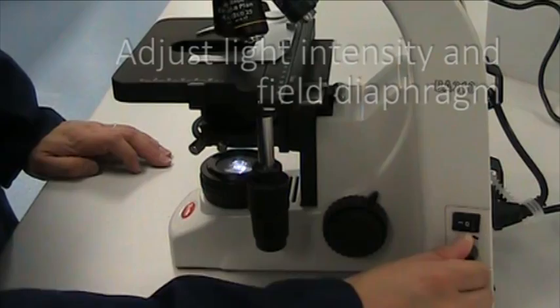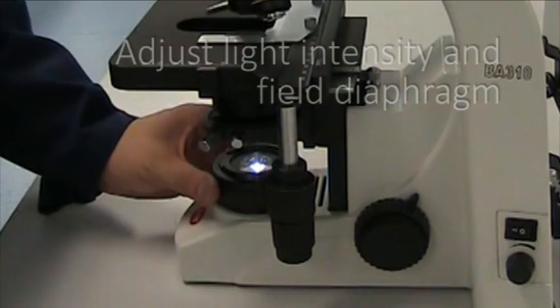Adjust the light intensity using the dial underneath the power switch. Then, rotate the ring around the light source to fully open the field diaphragm.